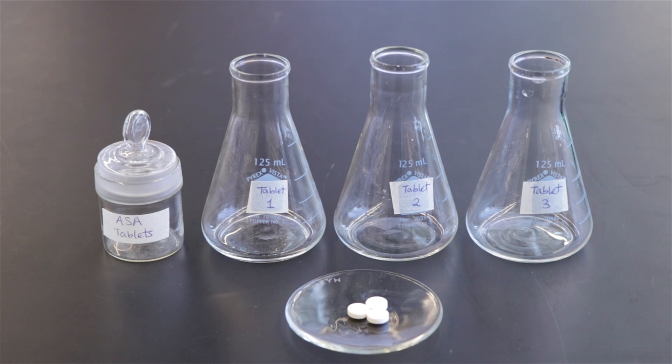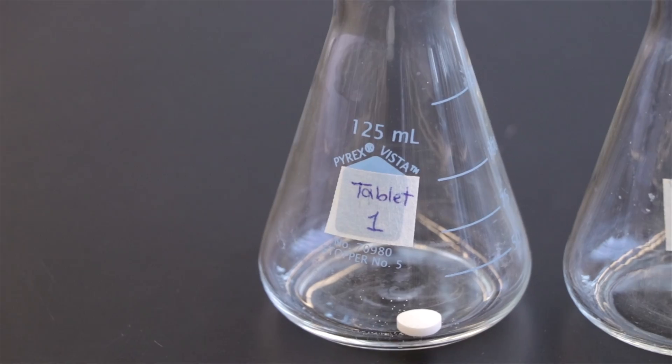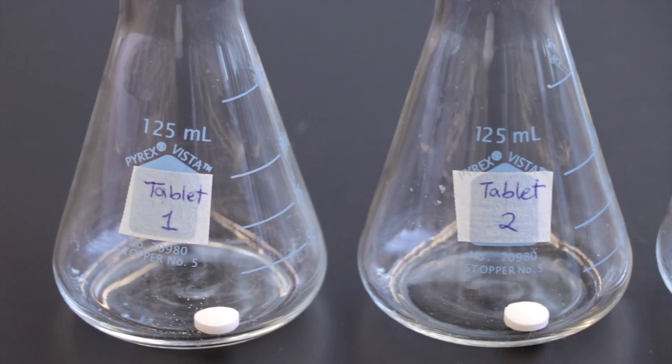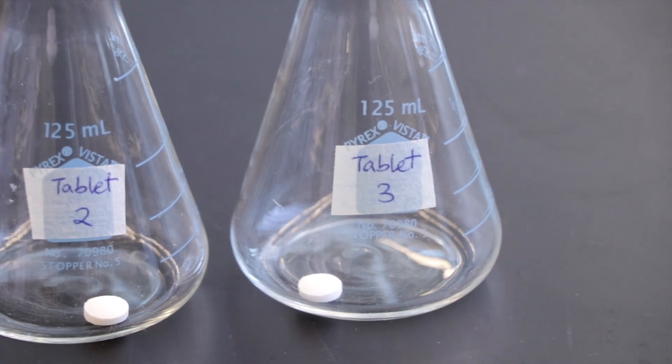Begin by accurately weighing by difference three aspirin tablets. This is the equipment you should bring with you to the analytical balance room. Weigh each tablet individually and transfer to a labeled 125 ml Erlenmeyer flask.